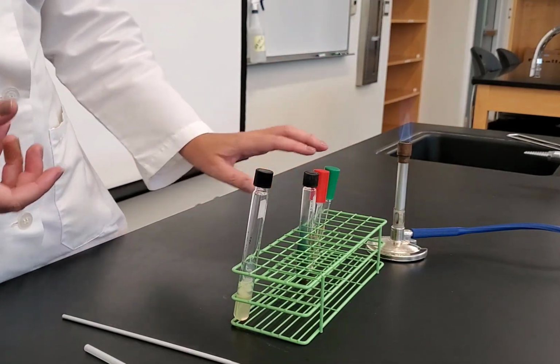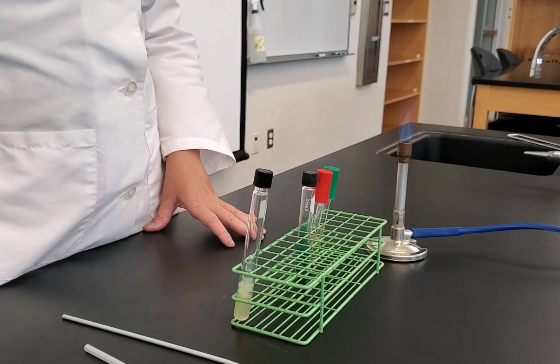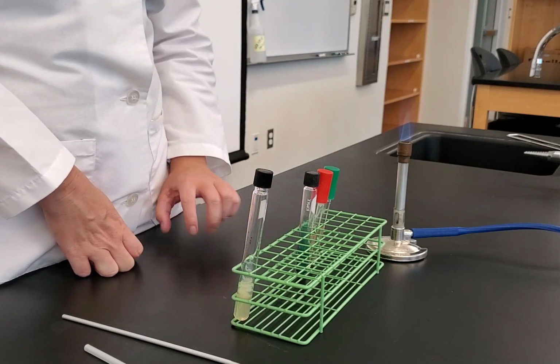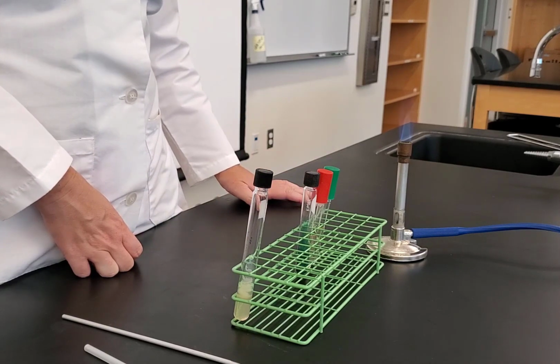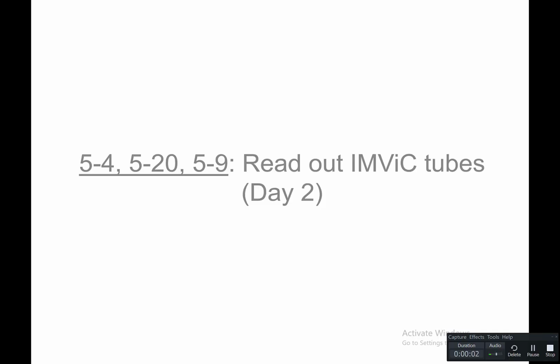And so I would do my 3 tubes for my organism, and then I would do the other 3 tubes with my second organism, and then I would take these tubes and I would put them in the incubator, and then I would do my readout 48 hours later. And so this is how I set up my IMViC. So now we're going to move on to day 2, talking about our readout of our IMViC tubes. So after our tubes have been incubated for 48 hours.